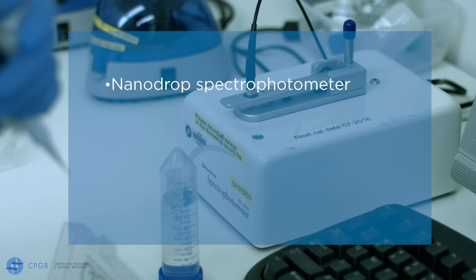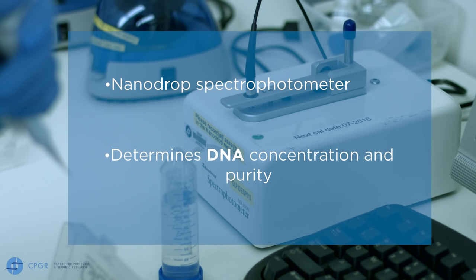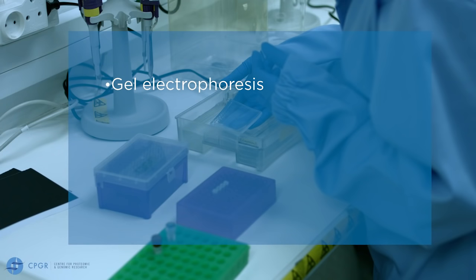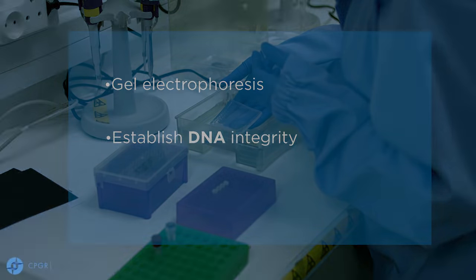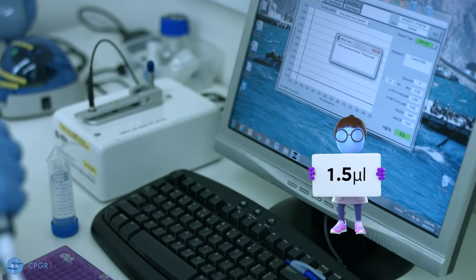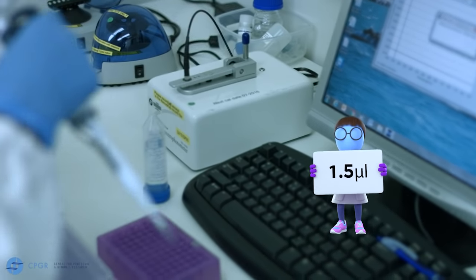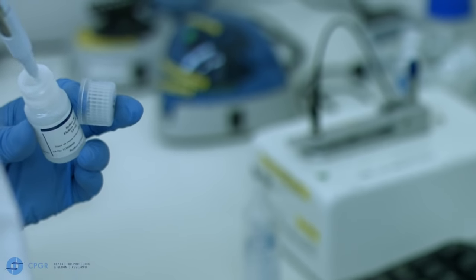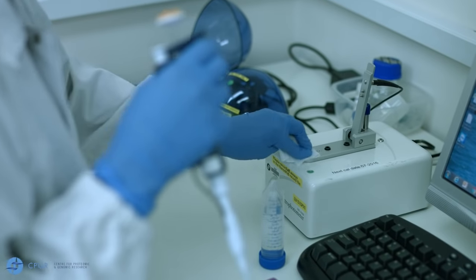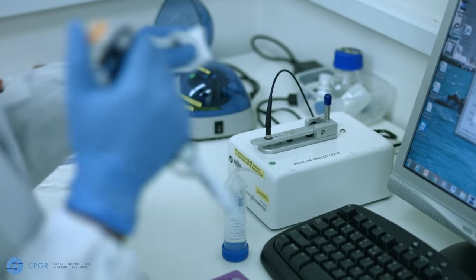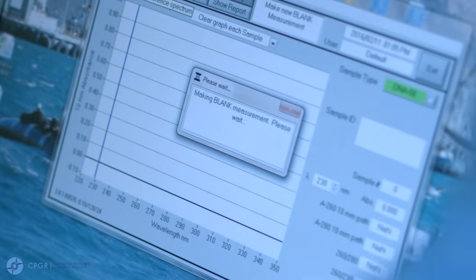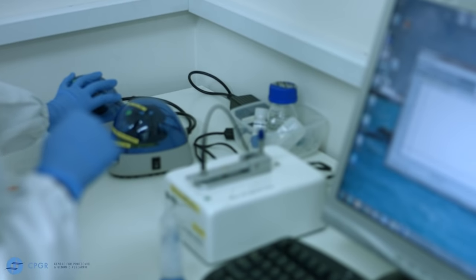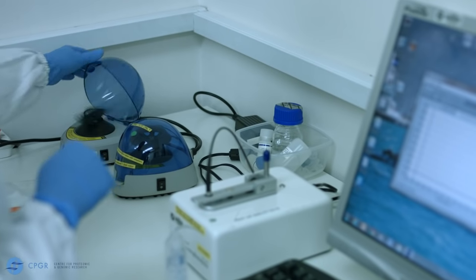We are going to use the nanodrop spectrophotometer to determine the DNA concentration and purity. This will be followed by gel electrophoresis to establish DNA integrity. For the nanodrop, we will use 1.5 microliters of DNA sample and we will use the AE buffer to blank the instrument, because this is what the DNA samples have been eluted in.